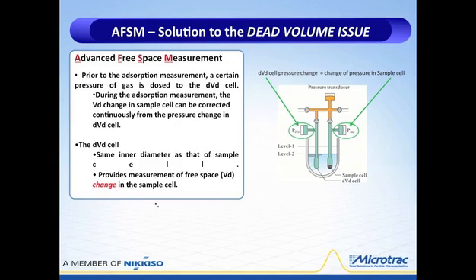But we want to run a blank to make sure that any development of any spectrophotometric coloration or anything of that nature, if that were to develop, that would cause error in our measurement. So what's necessary is to use a blank. So this is very similar to using a blank.